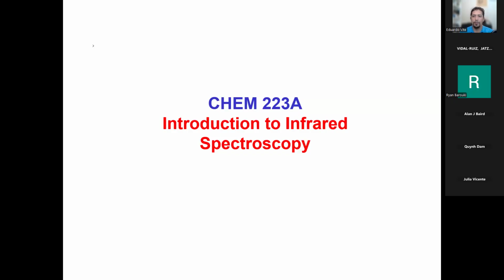We are going to talk about infrared spectroscopy today. Last week, I took you into the hallway and showed you what the instrument looked like, and we saw it. We're not going to get to use it this semester. Maybe next semester you will, but we are going to learn about the theory and the principles behind infrared spectroscopy. What is it? How does it work? Let's just get to it.